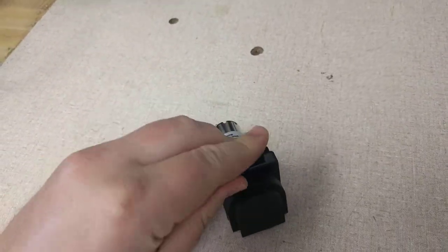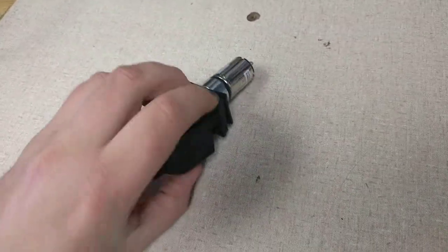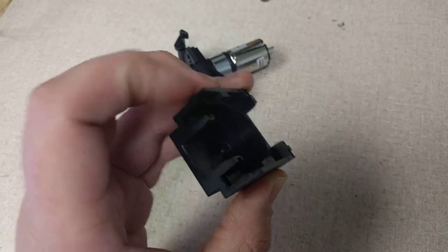You can see it's quite small with the standard DC motor that's in the palm of your hand. The top section comes right out. The tube set sits right on the head and is held in by clips that slide into these slots.